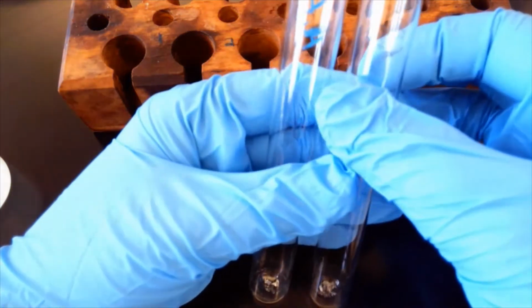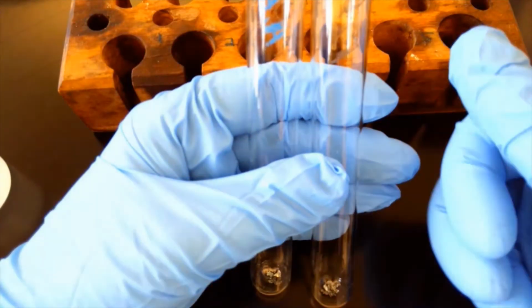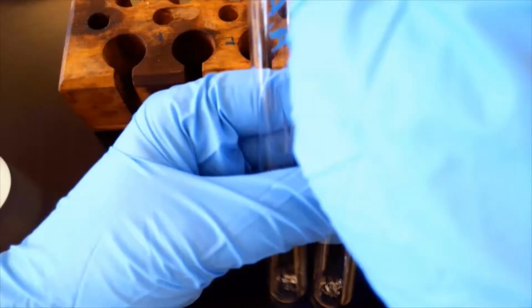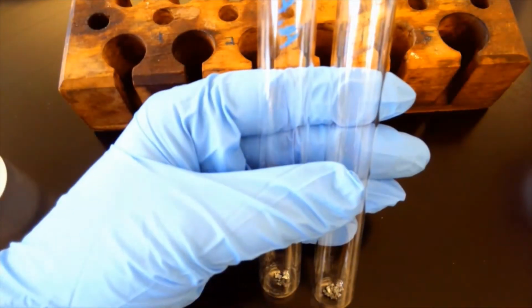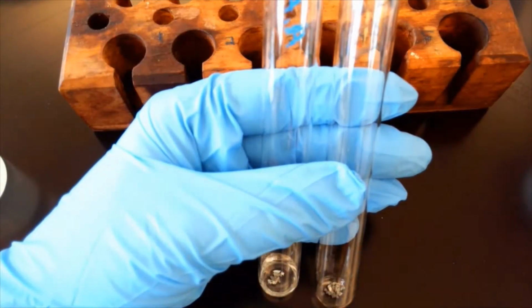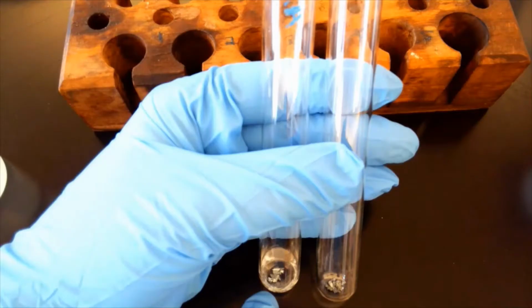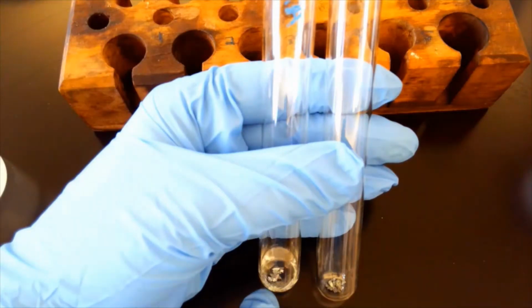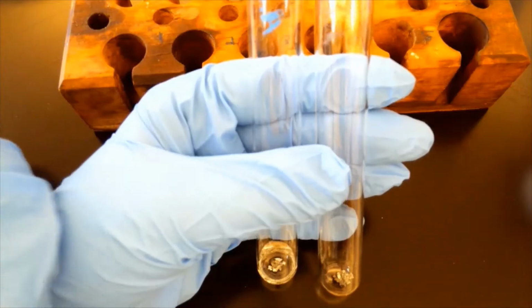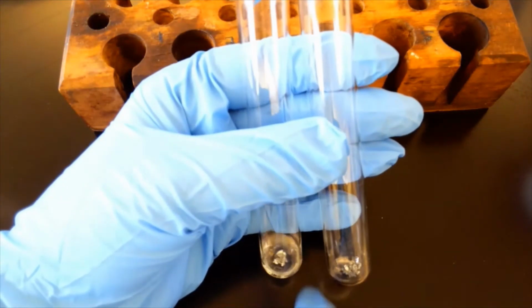So we are going to add some in and then watch what happens, and I'll describe what's happening as well. If we start with the acetic acid, we're going to put this in, and immediately you start seeing some bubbling. You can see a little bit of bubbles forming, very small, not a lot, a little bit of gas, a very strong odor, by the way. It smells very much like vinegar, but quiet little tiny bubbles happening.